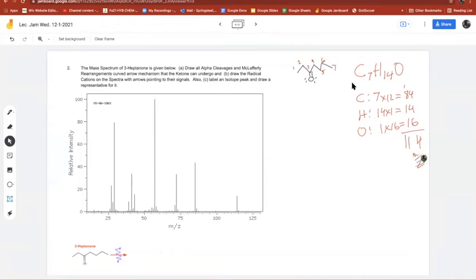That's the molecular ion, right? So down here, I'll draw the molecular ion. It's going to lose an electron, and most likely it's going to lose it from one of these lone electrons. There we go. We lost it. And then this should weigh 114. Do we see a 114? There it is. That's the molecular ion.